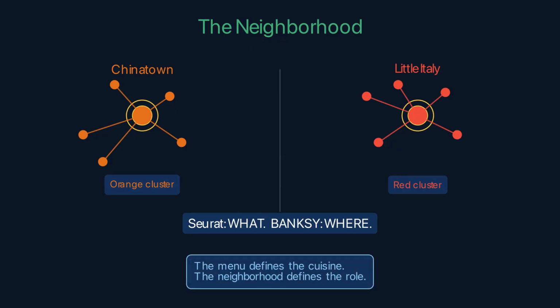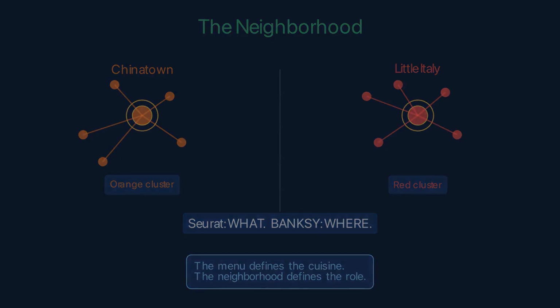A macrophage is always a macrophage, Seurat's answer. But a tumor-adjacent macrophage plays a different role, Banksy's answer. The graph was always there. Banksy finally reads the edges.